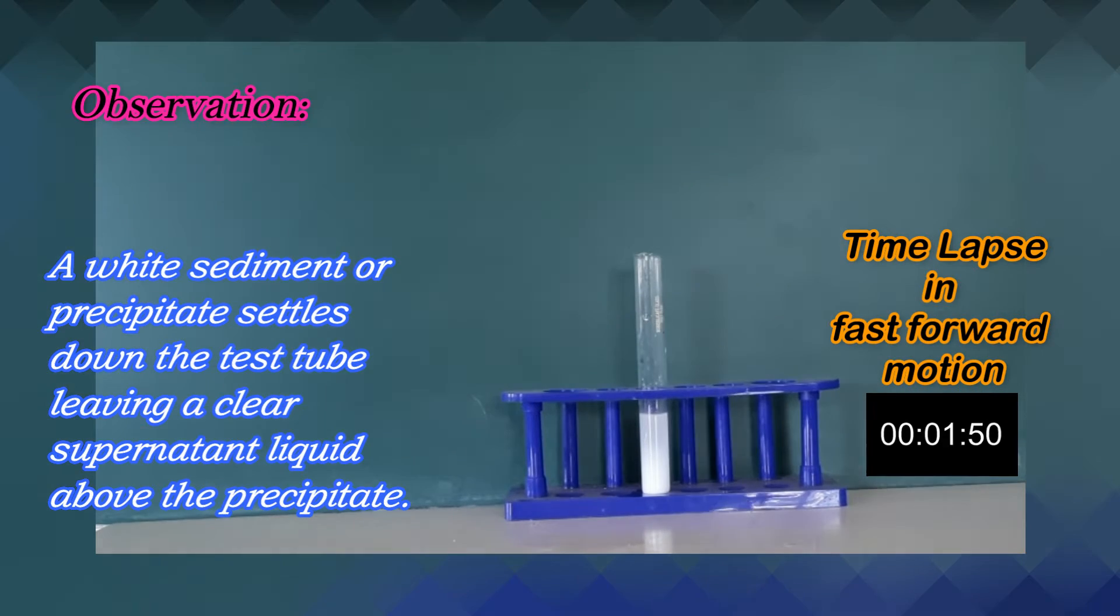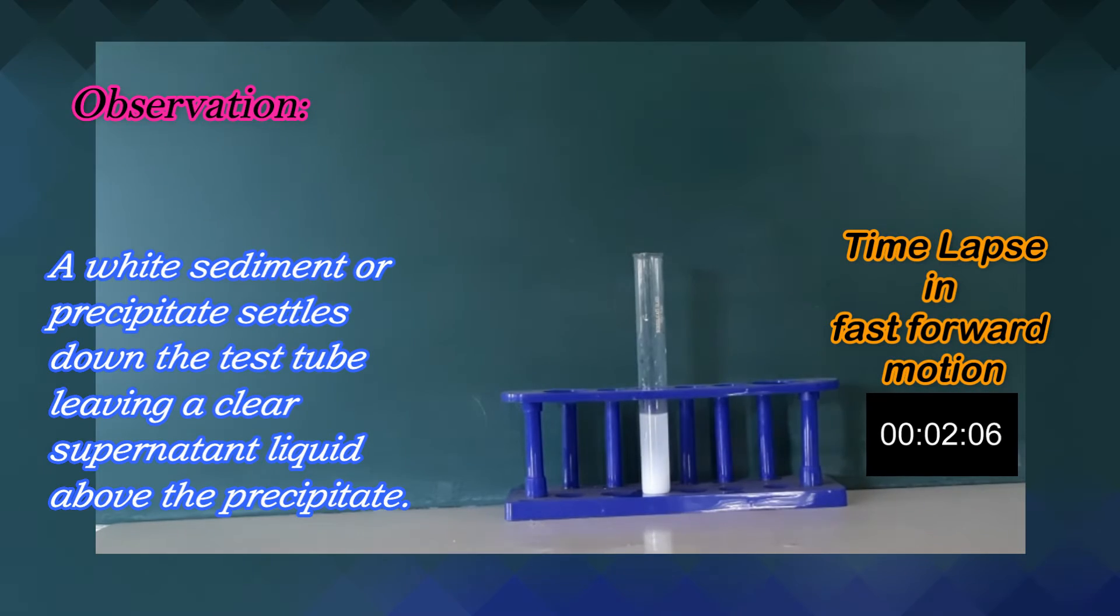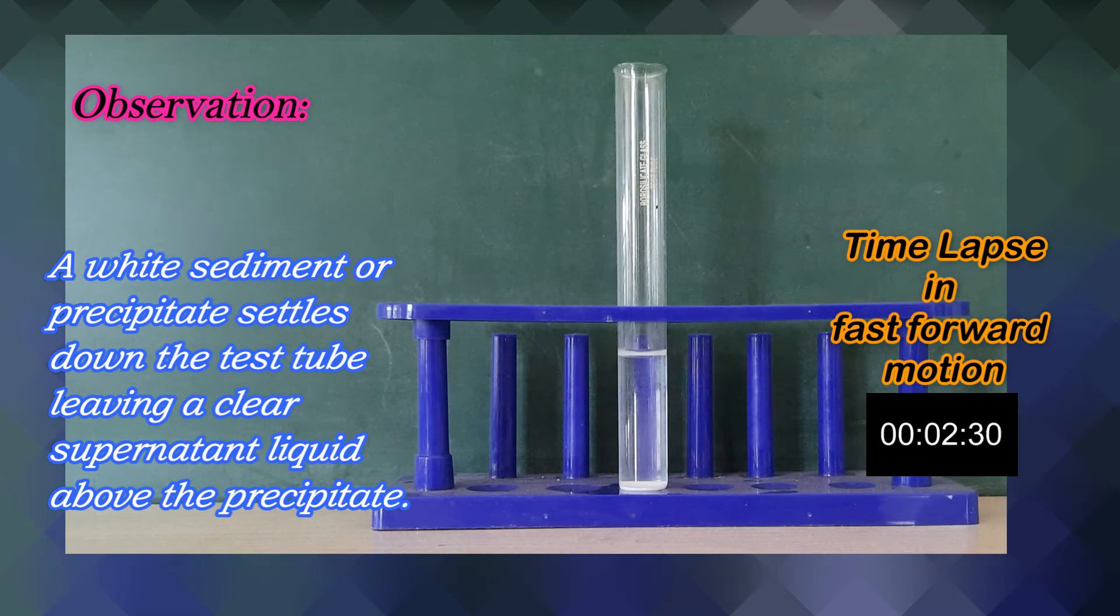Observation: A white sediment or precipitate settles down the test tube, leaving a clear supernatant liquid above the precipitate.